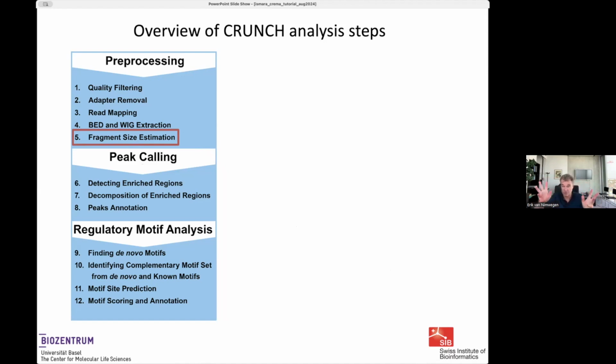And so then we will use that information and we know exactly the fragment starts and ends. But in many cases, people upload data where only one end of the fragment has been sequenced. And so then we don't know how long the fragment was that we sequenced one end of, and we somehow have to infer what was the typical length of fragments in the input data.